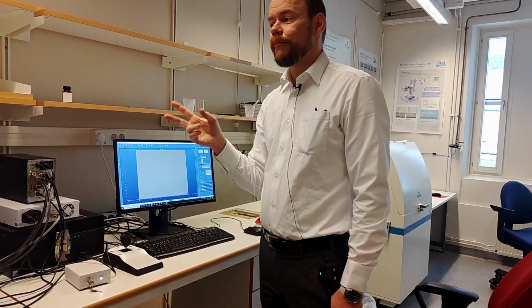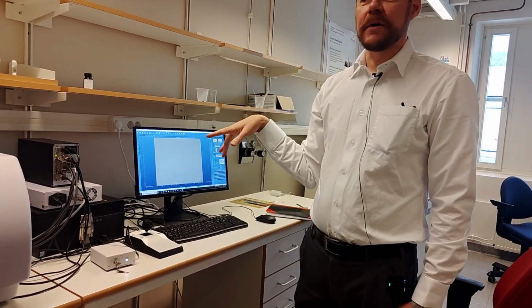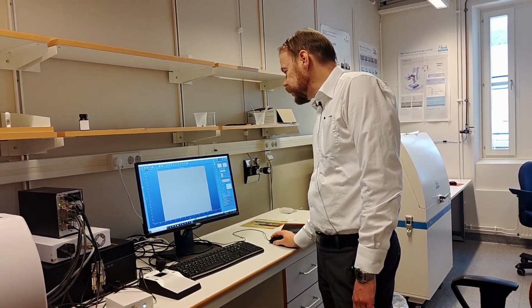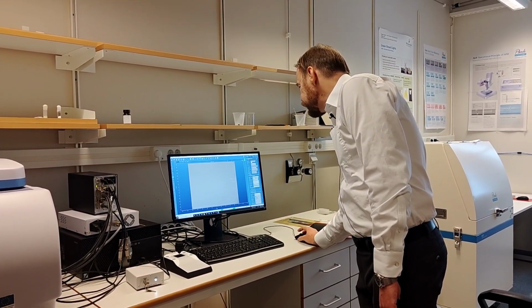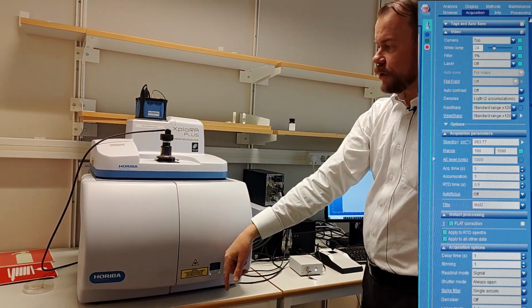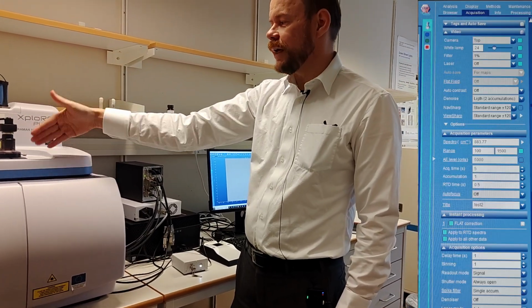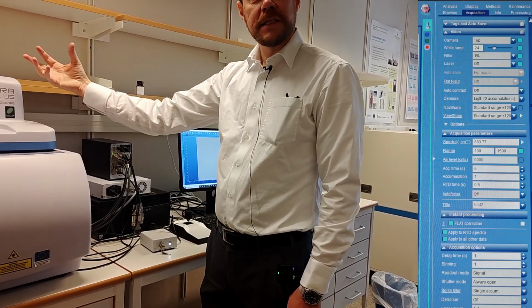So step one is we can check this in the camera view. And on this machine there are 2 cameras. This one that is called the top camera, that's what we're having here. If I click on acquisition here, I can go to top here. It says camera top. So this camera is filming through the microscope straight down. This cannot see the laser, because if we use this camera, it turns off the spectrometer and laser. So you can only use either one. But there is also an internal camera here, and that can be on at the same time, so to say.